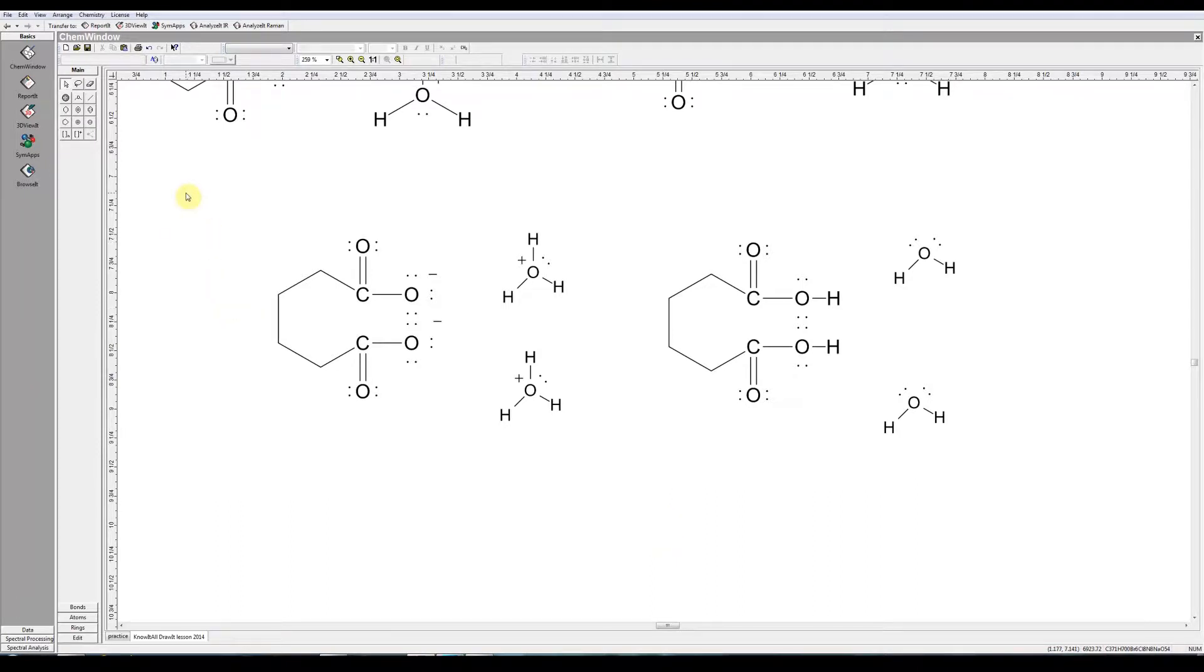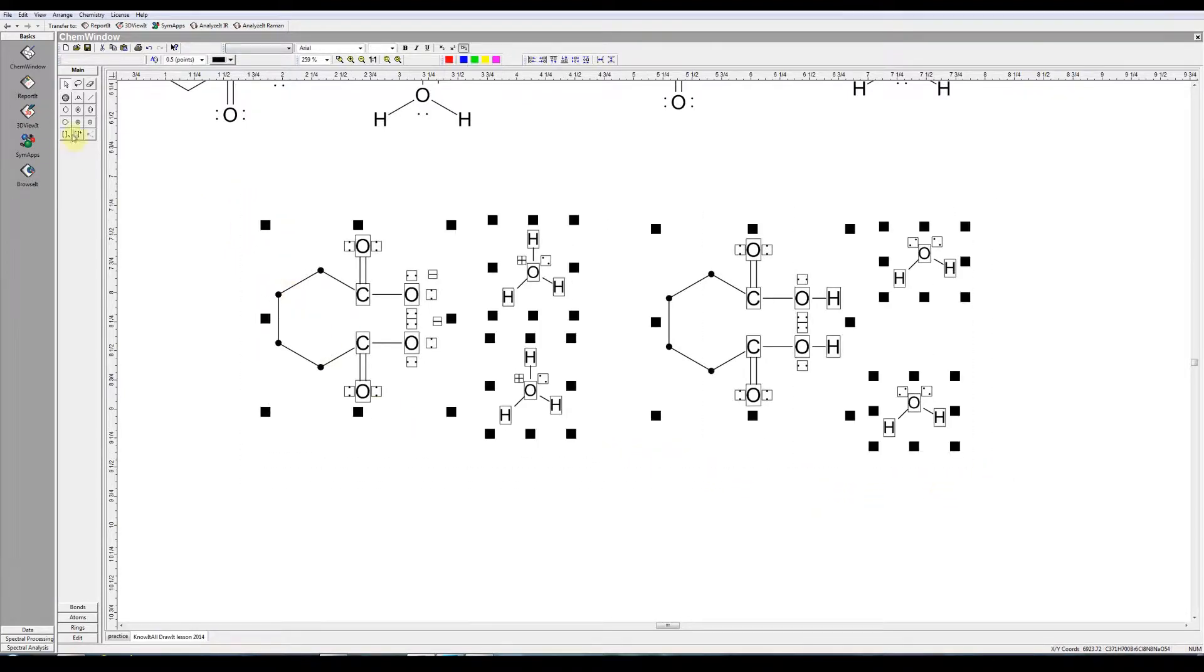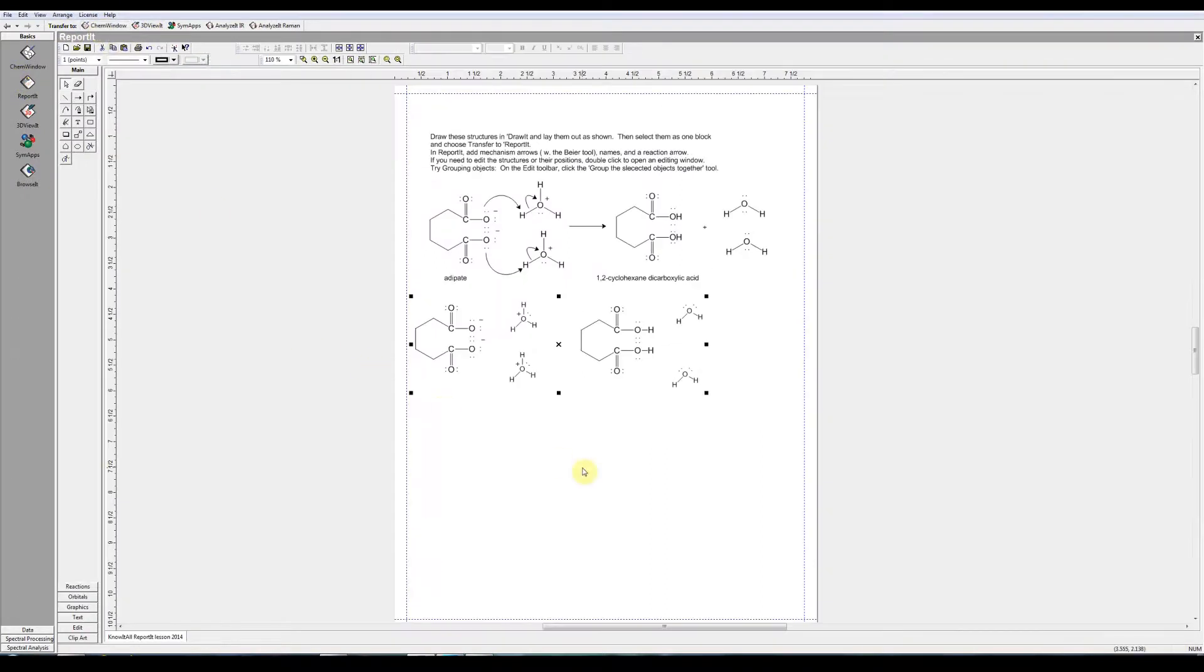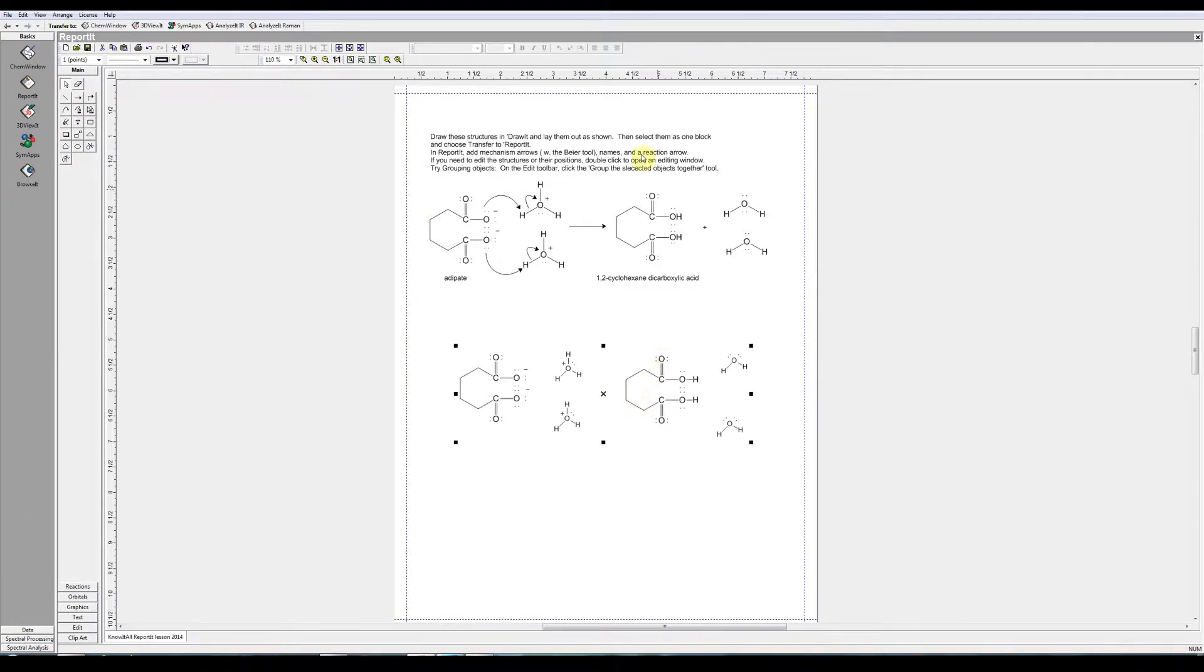That's all we can really do in ChemWindow. We have to now transfer this to report it to actually finish the chemical reaction equation. We're going to select this material only. Transfer to, up here, transfer to, report it. So don't open report it, but rather transfer to, report it. And here it's pulled in to report it. I already have created the final work here so you can see what we're trying to do.